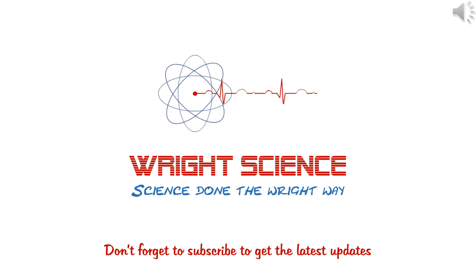Hopefully, at the end of this video you can now define the term aseptic technique, describe how to perform aseptic technique, and also describe how to isolate bacterial colonies for identification using a streak plate.